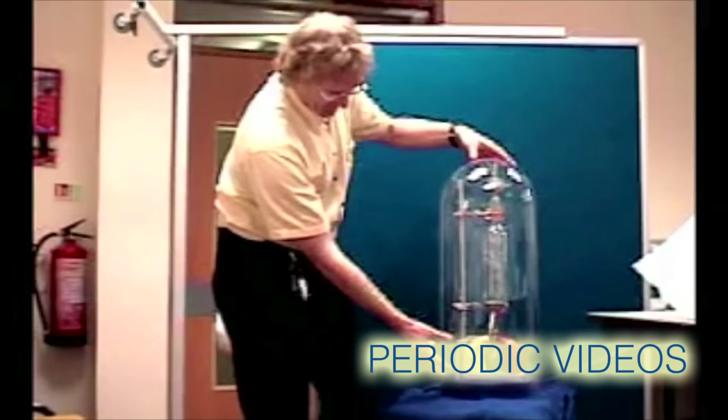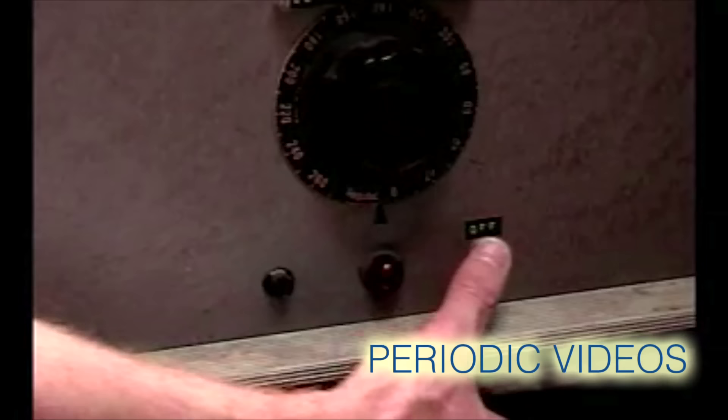People initially, when we used to show it, they would just assume it was mercury because it looks the same. This sodium-potassium fountain, liquid metal fountain, is a device that enables you to safely move these liquids around without letting them get exposed to the atmosphere.